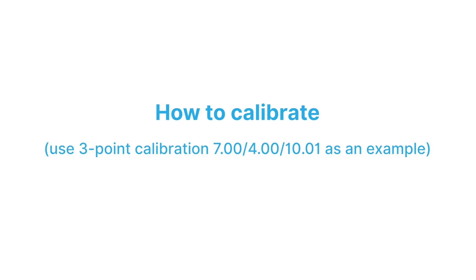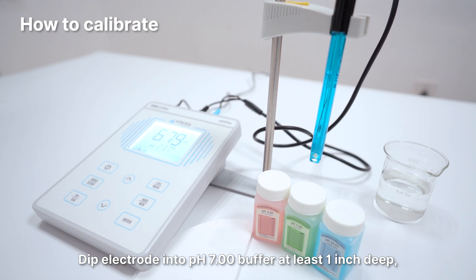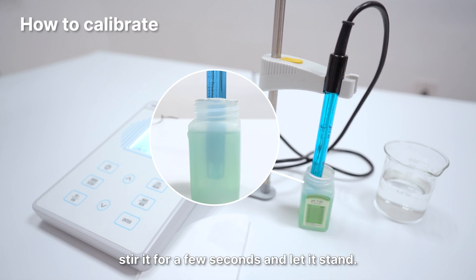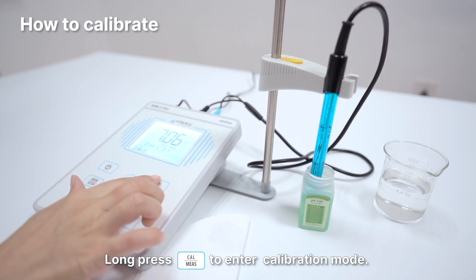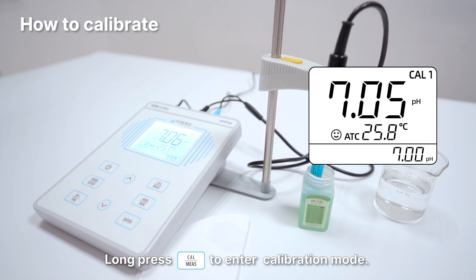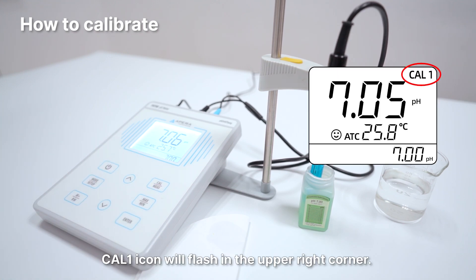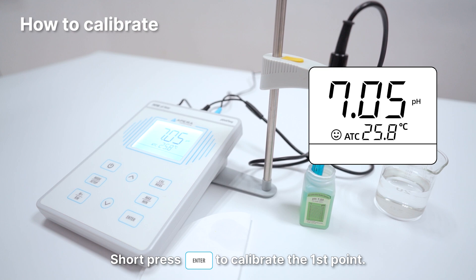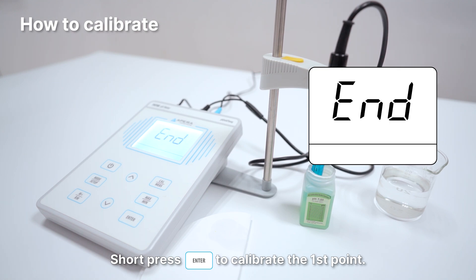How to calibrate: Dip the electrode into pH 7.00 buffer at least 1 inch deep, stir it for a few seconds and let it stand. Long press the Cal button to enter calibration mode. Cal 1 icon will flash in the upper right corner. Wait for the reading to stabilize. When the reading is stabilized, the smile face appears and stays. Short press the Enter button to calibrate the first point.